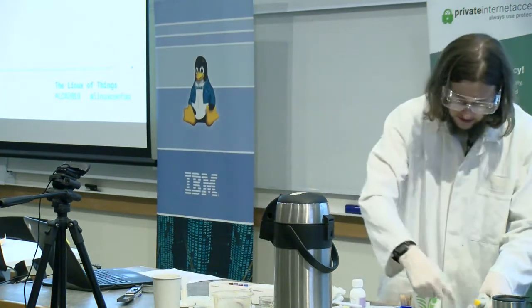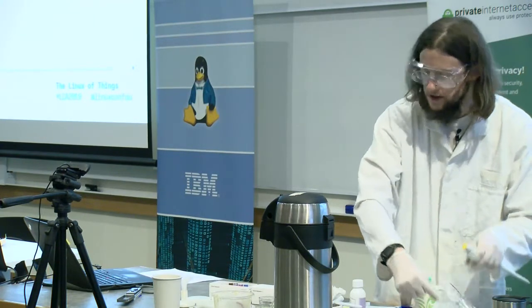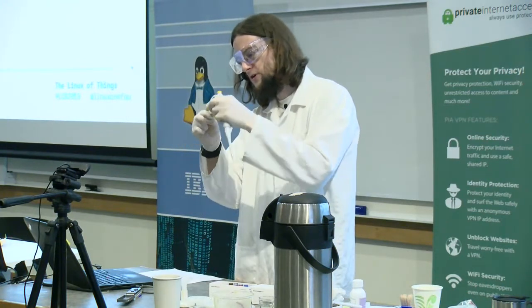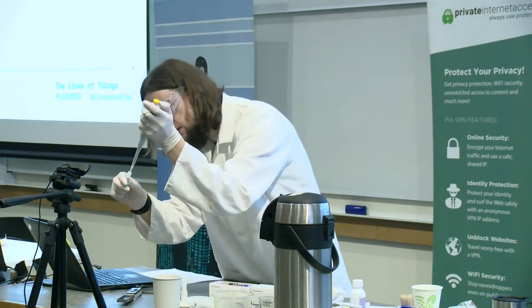And for this, I need 1 microliter. That's a very tiny amount. I'm not actually sure if I'm going to be able to get 1 microliter, so I'll probably try and get a little bit more than 1.